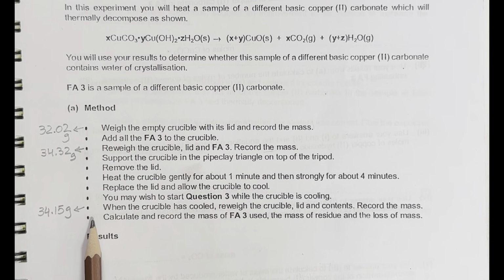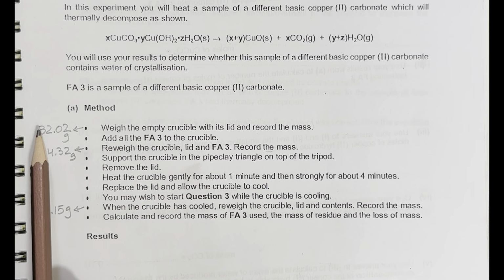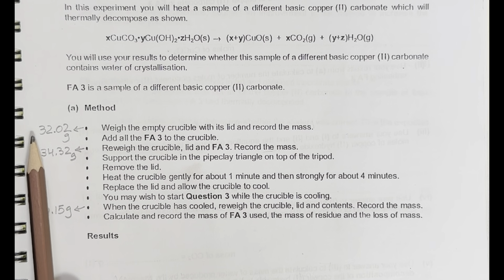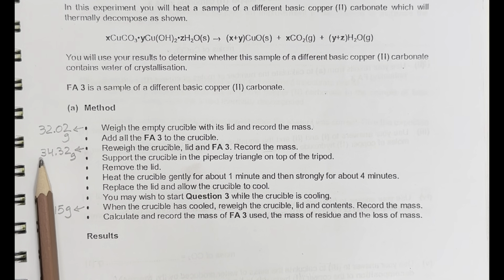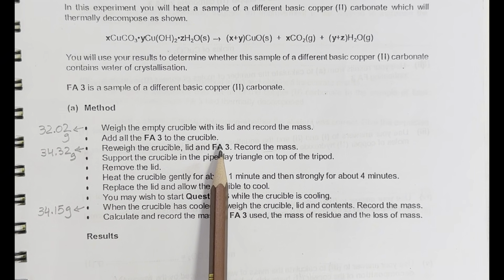The mass of crucible and the lid with the contents is 34.15 grams. Then calculate and record the mass of FA3 used, which can easily be calculated by subtracting these two values, the crucible and the lid, and the crucible with lid and FA3. So once we subtract these two values, we will get the mass of FA3 used.